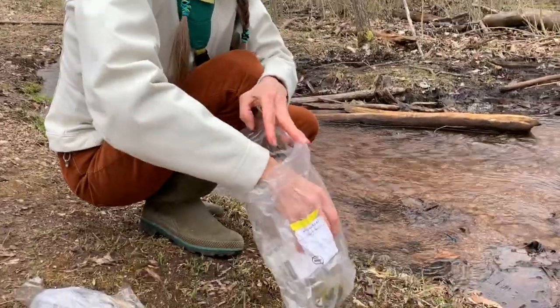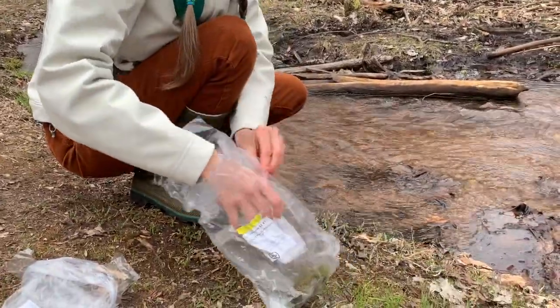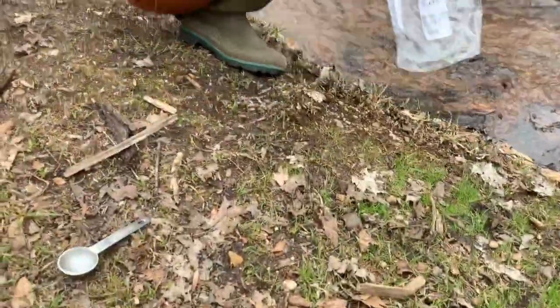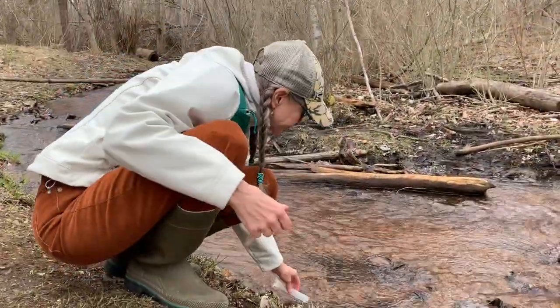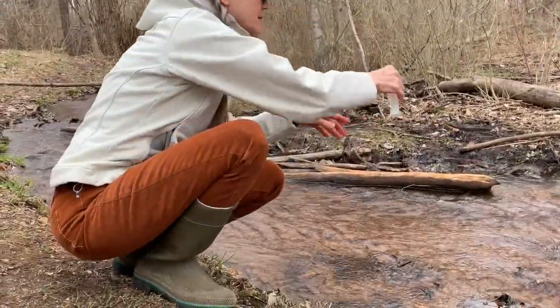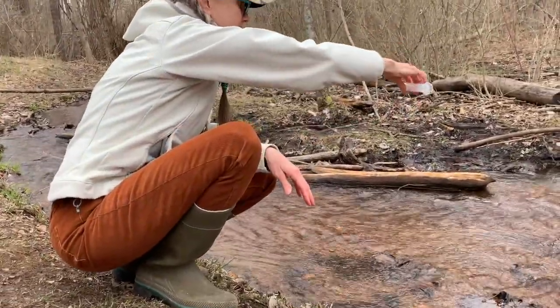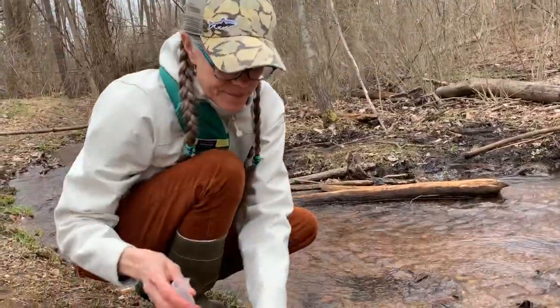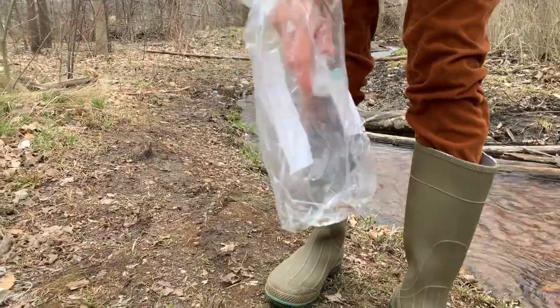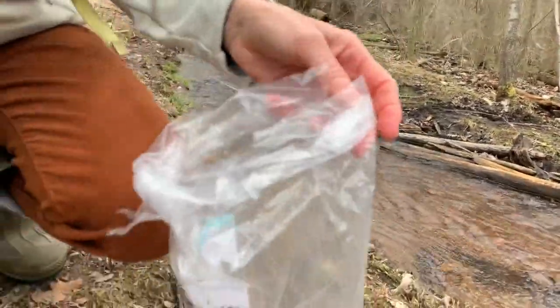And again, I want to make sure I get this as close to my sample as I can. And then one more. A little bit more. Okay. And so I've added my 10 milliliters of water to each bag.